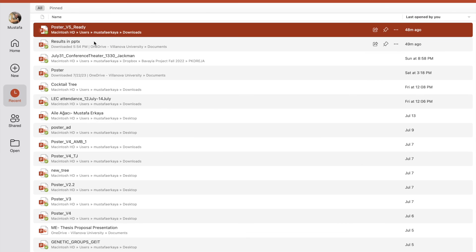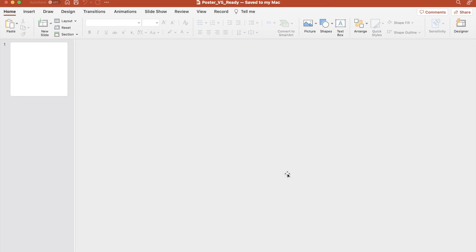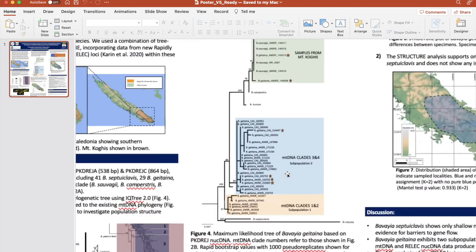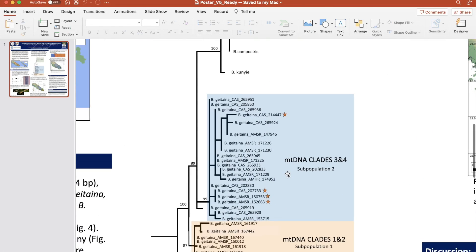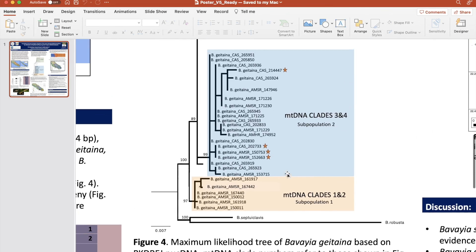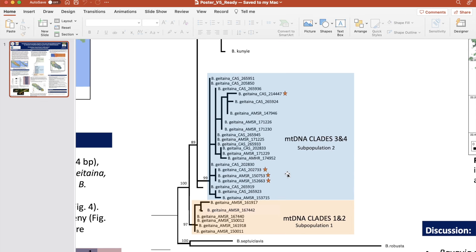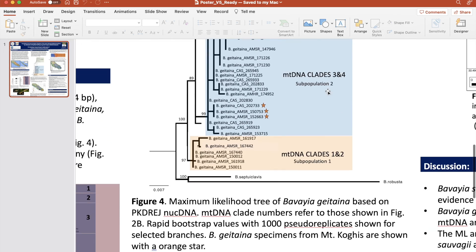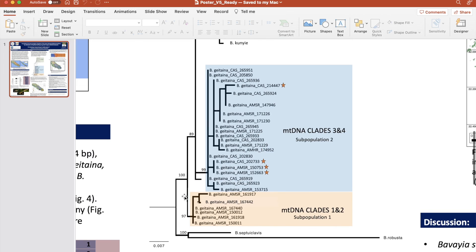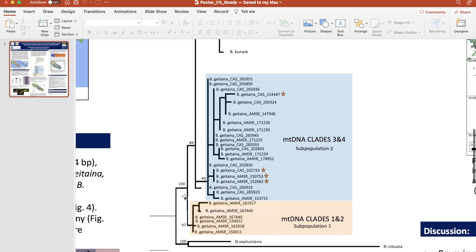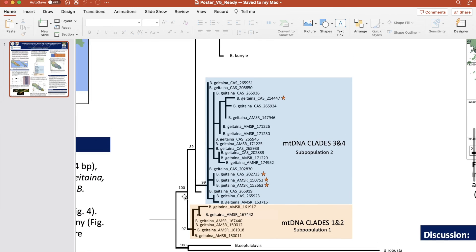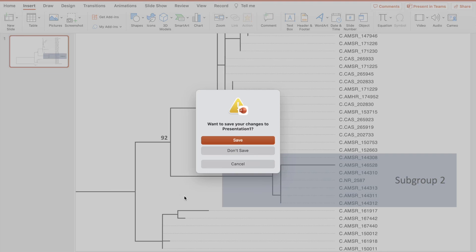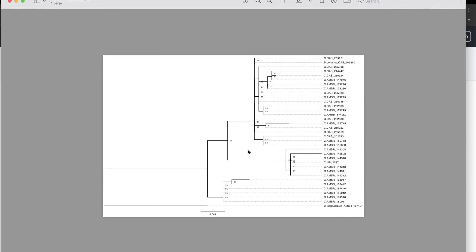In the end, you can create phylogenetic trees that are going to look like this. The resolution is really high. I have some stars, I highlighted them, I have my bootstrap values — everything looks very publishable. And that is how you use FigTree.